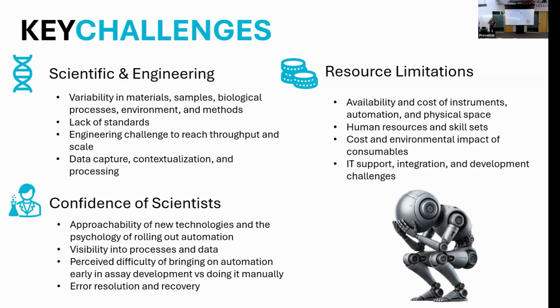And then really the human aspect, the psychology of bringing automation into a lab, is something that's often overlooked. What is the impact going to be on the scientist? Is your lab manager solving problems that aren't the real problem?